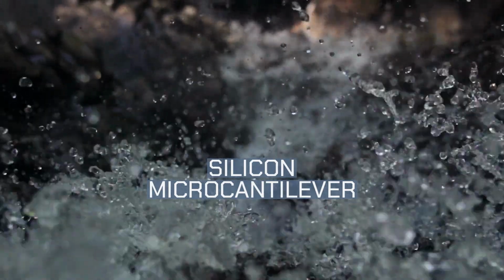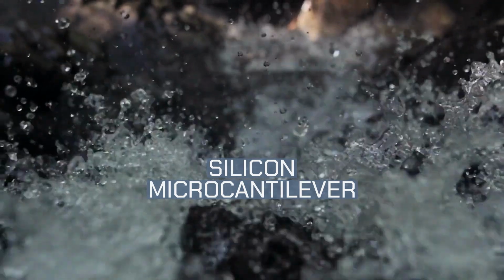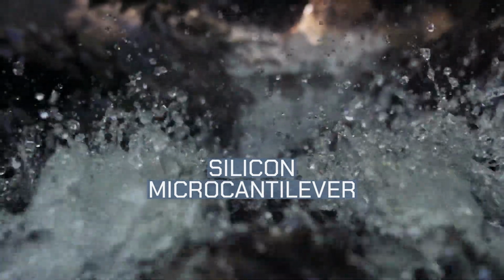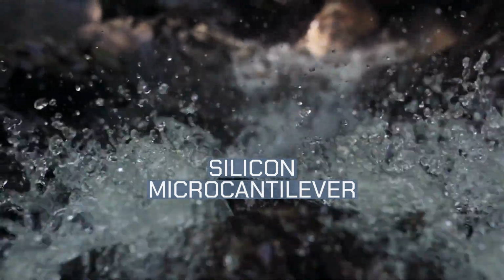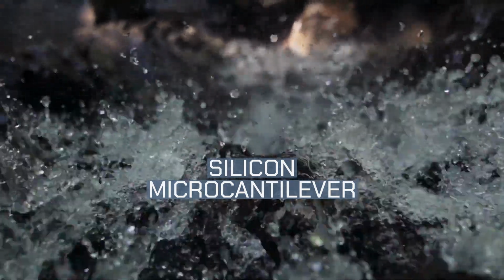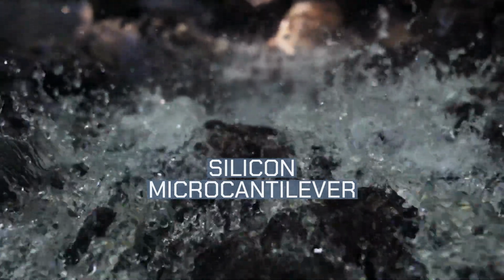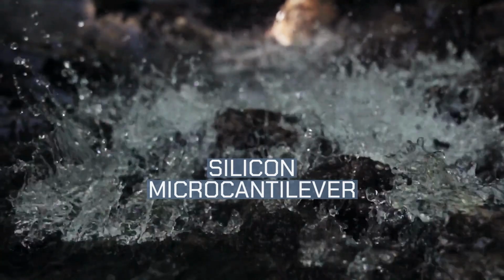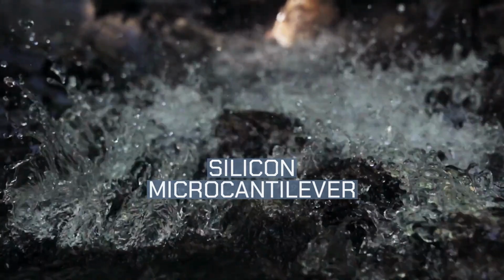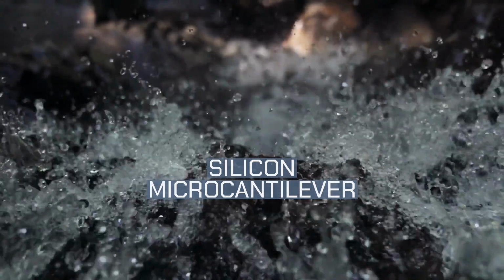In the next segment, we'll be exploring silicon microcantilevers. Silicon microcantilevers are used for both contact AFM and nc-AFM. Silicon microcantilevers are produced from etching small rectangular, triangular, or V-shaped cantilevers from silicon nitride. Originally, they were produced without integrated tips and metal tips had to be evaporated on. Later, a method was found to integrate the tips into the cantilever fabrication process.